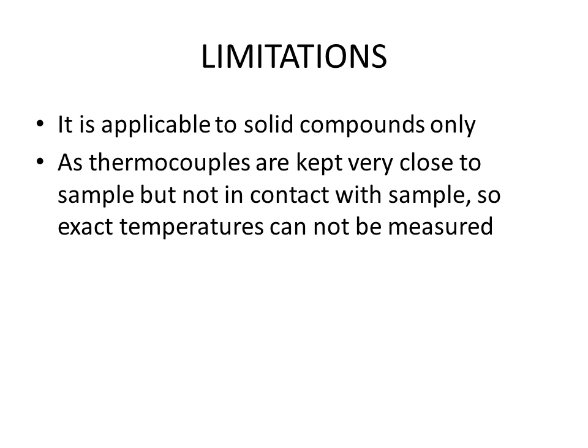Here are some of the limitations of this technique. The first one is that it is only applicable to solid compounds, meaning only solid compounds can be run in this technique, so definitely it becomes a limitation. The next one is that as thermocouples are kept very close to the sample but not in contact with the sample, the exact temperature cannot be measured. We know that thermocouples are temperature sensors. They sense the temperature of the sample, and they are kept very close to the sample but not in contact, so definitely the temperature measured by them is not the exact temperature, so this could be a limitation of this technique.